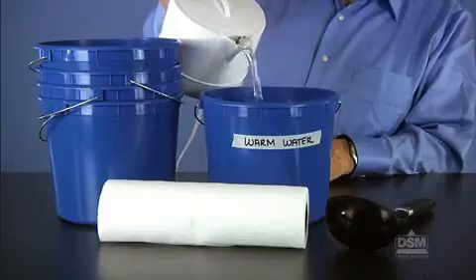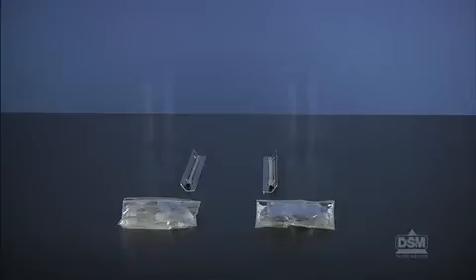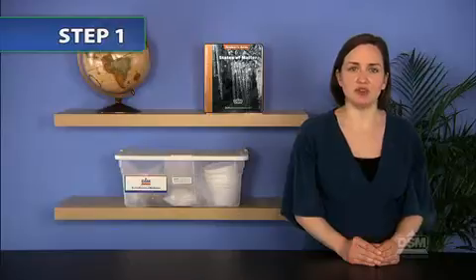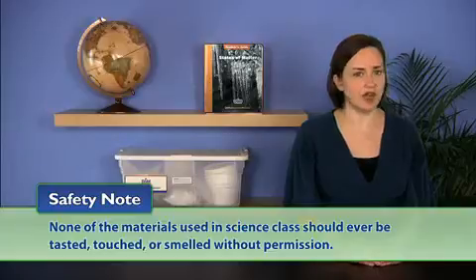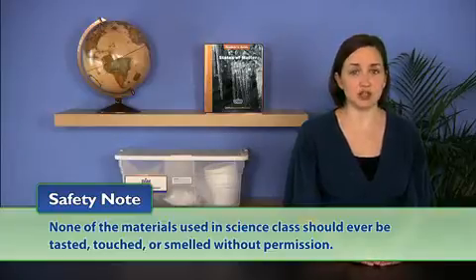Set up a distribution station with 6 pails of warm water, 2 ladles, and paper towels. Each team of 2 will need a plastic bag containing crushed ice, a plastic bag containing butyl stearate, 2 thermometers, and 2 tumblers. To begin the activity, distribute the materials and a couple of paper towels to each team of 2. Caution students that none of the materials used in science class should ever be tasted, touched, or smelled without permission from you.